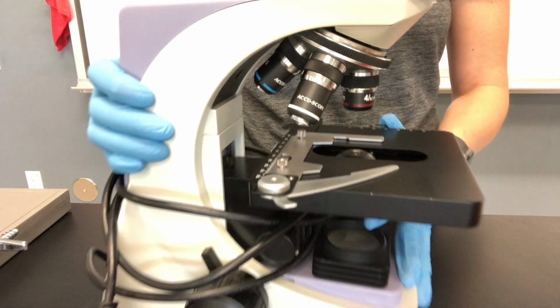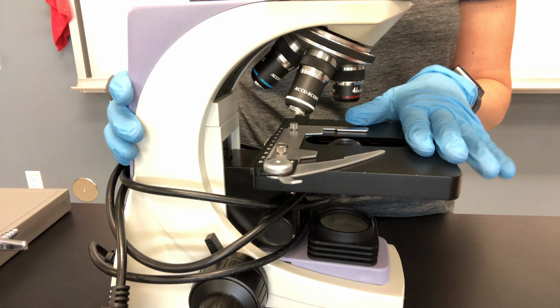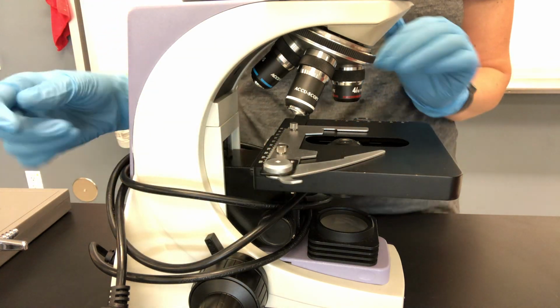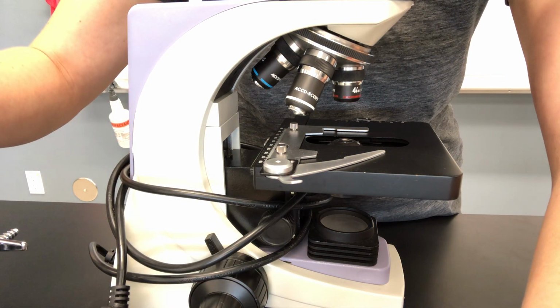There we go. All right, so there's our objectives. This black piece right here is called the stage, and we have a stage clip. And so our slide's going to fit on that. I'm going to get a slide out of my slide box right here.